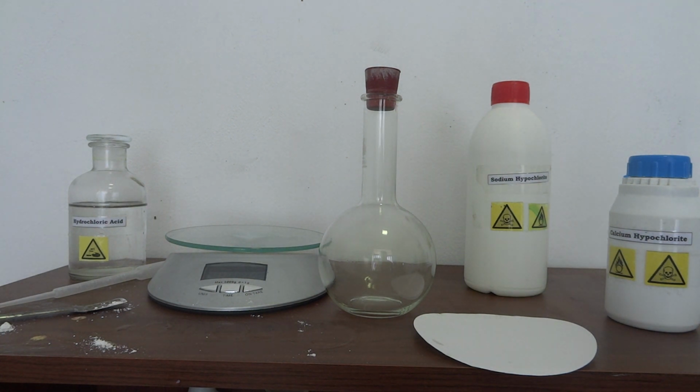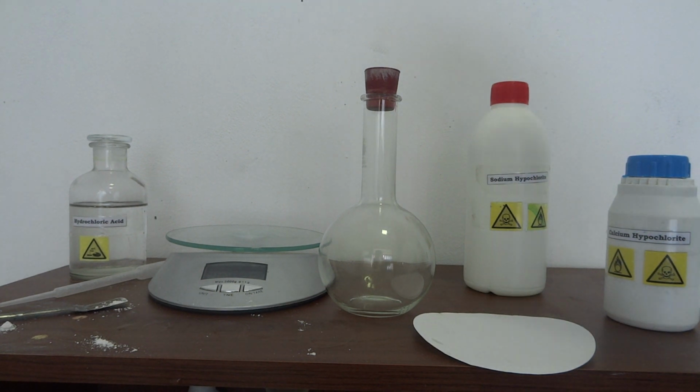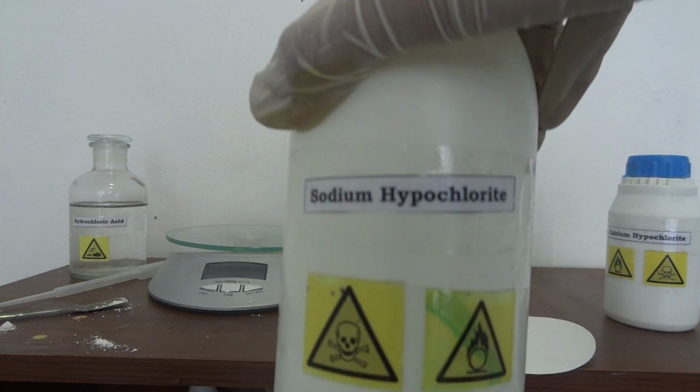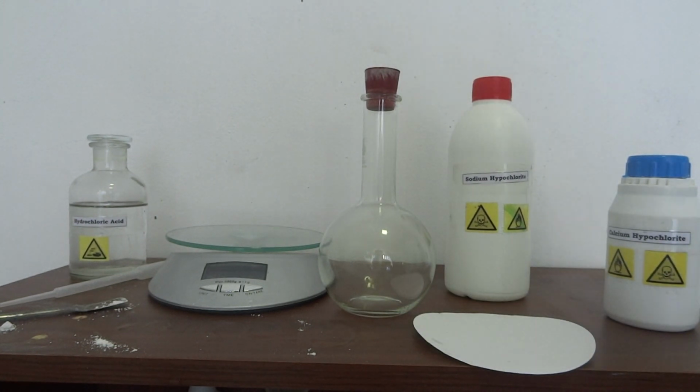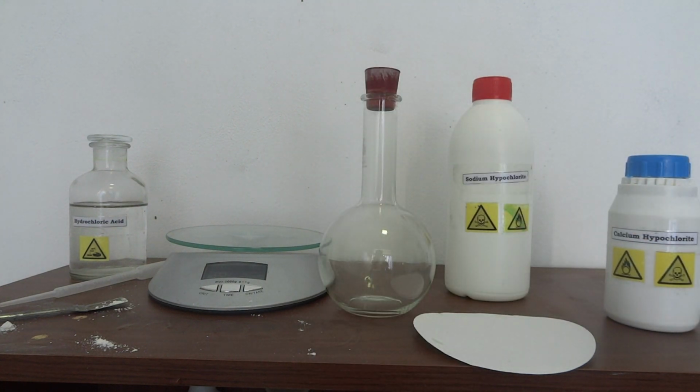If you were to ask what the smell of chlorine is, well, it smells like extremely concentrated bleach. This is sodium hypochlorite, which is regular household bleach. Even chlorine gas can be made by that too, but the chlorine produced will be quite low. The yield will be quite low. But with calcium hypochlorite, the yield will be more. So that's why I use calcium hypochlorite.